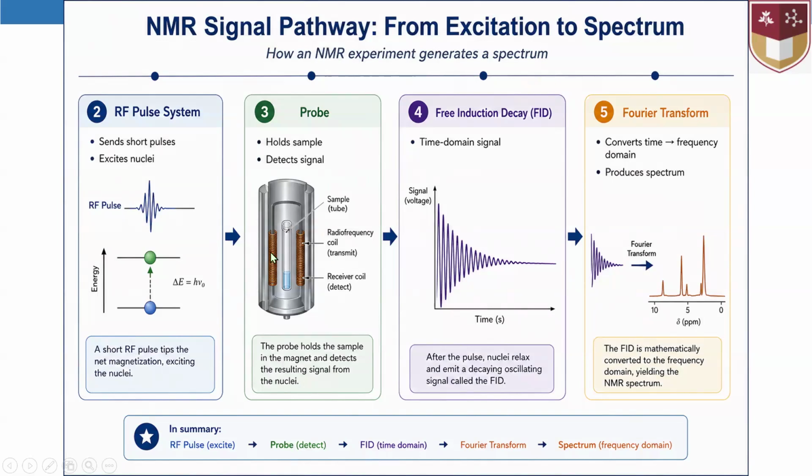And as I explained at the beginning of the video lesson, NMR has this kind of tools inside it based on the energy that causes the resonance.